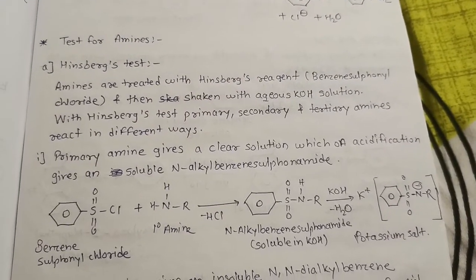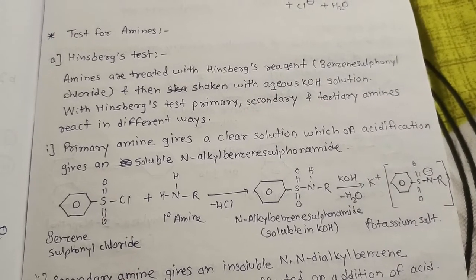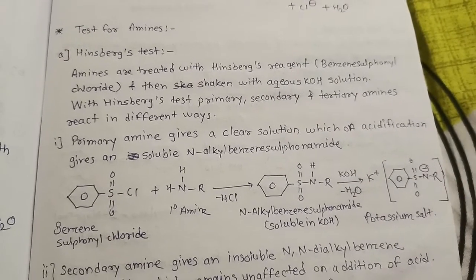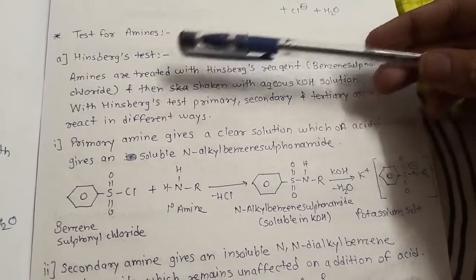Hello friends, today we'll see tests for amines. These are the tests to distinguish between aliphatic and aromatic amines, as well as we can distinguish primary, secondary and tertiary amines by these tests. So the first test in this category is Hinsberg test.